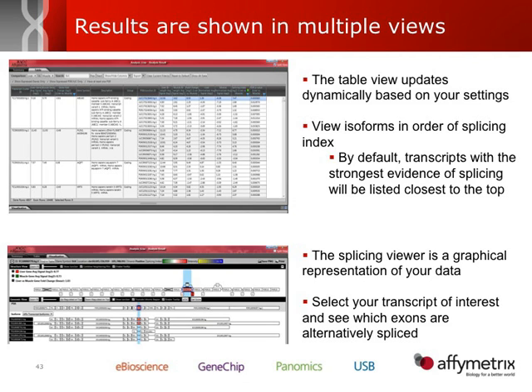And you can sort and filter based on any of these columns, just like we did with the gene level analysis. And then we also have a really great visualization tool that's built into Transcriptome Analysis Console that allows you to see your interesting hits and then find out whether there are known isoforms that express or that look like the isoform that you're seeing in your particular sample.